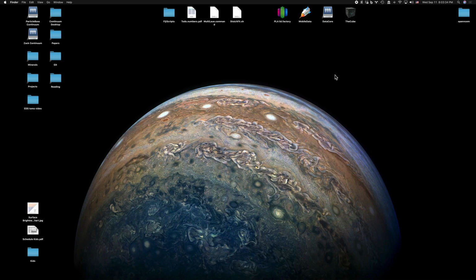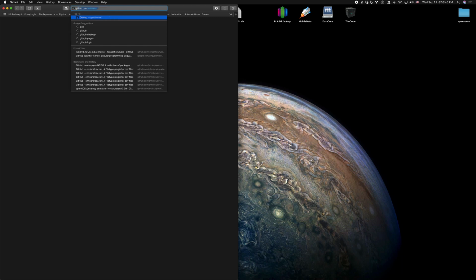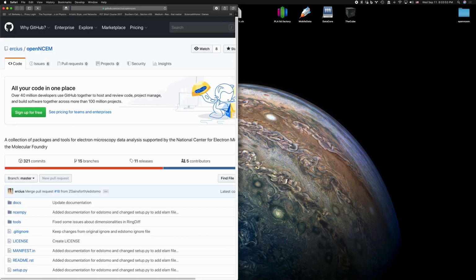Okay, so we are back at the computer now. I'm going to switch to the testing demo set. So first we open a browser. We're going to go to the GitHub site. So github.com, Ercius, ERCIUS, openNCEM. That is the GitHub site.